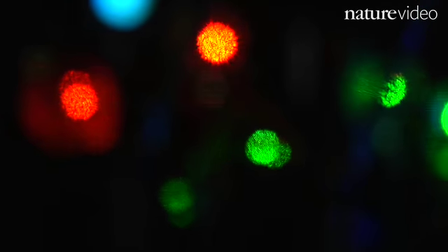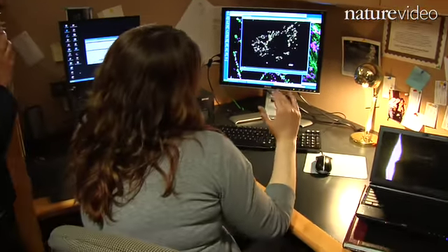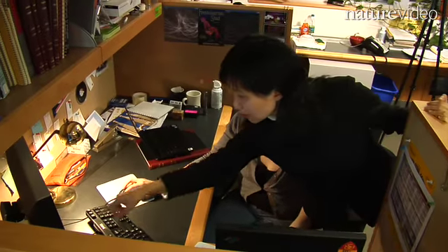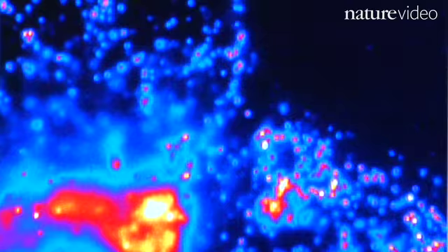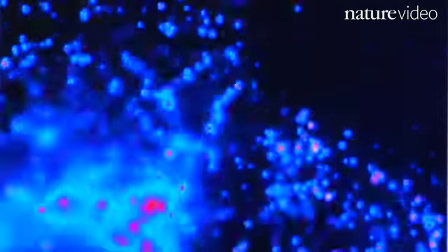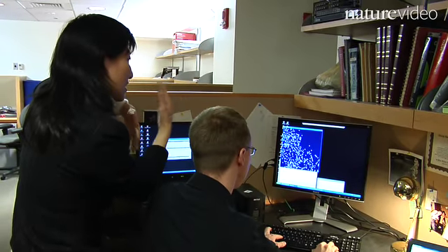Of course, in many biological samples, molecules are so densely packed that their images overlap, and then you lose the ability to fit this single molecule image to find the center. So then we thought hard about the problem, and we came up with this trick. The trick is you switch on these molecules separately in small groups, where each of the molecules that have been switched on are far enough apart so that their spots don't overlap. Eventually, I get a sufficient number of molecular positions, and then I stack them together to form an image.